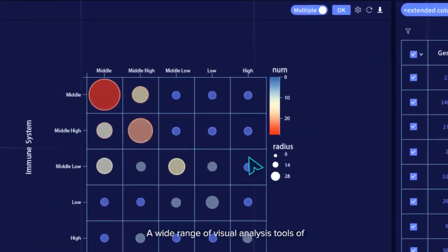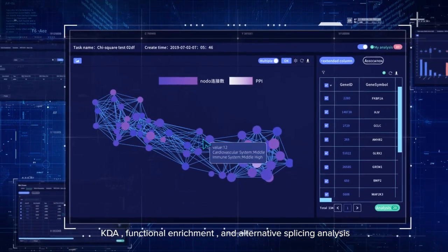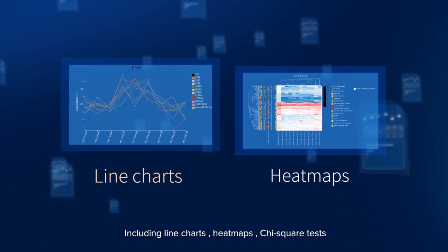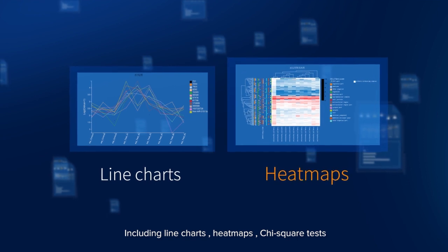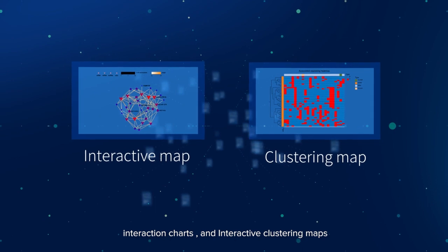And a wide range of visual analysis tools for KDA, functional enrichment and alternative splicing analysis, including line charts, heat maps, chi-square tests, interaction charts and interactive clustering maps.